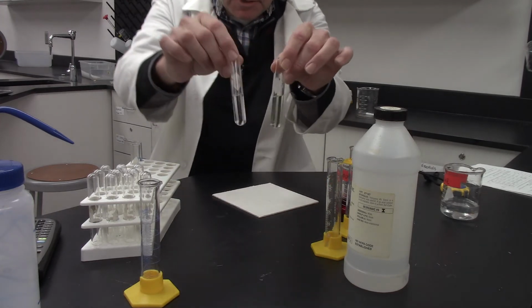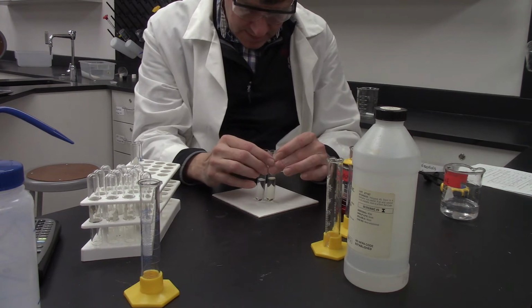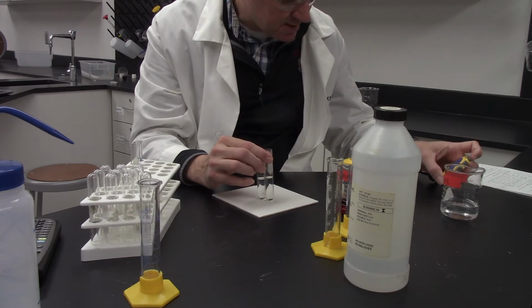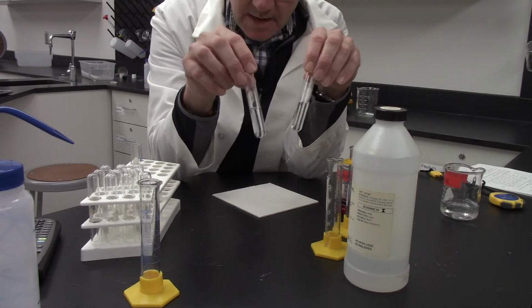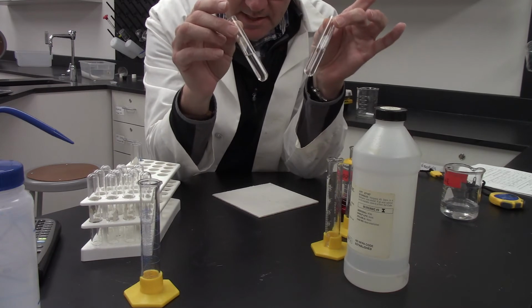And we're getting pretty close there, okay? And I'm going to stop the stopwatch. And we have about 86 seconds, okay? So at this point, the reaction has stopped because the iodine is used up.